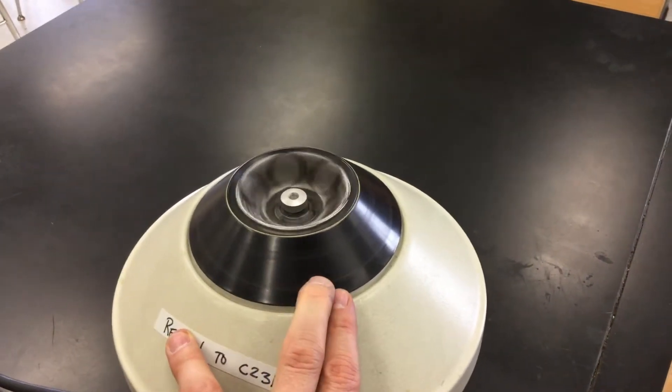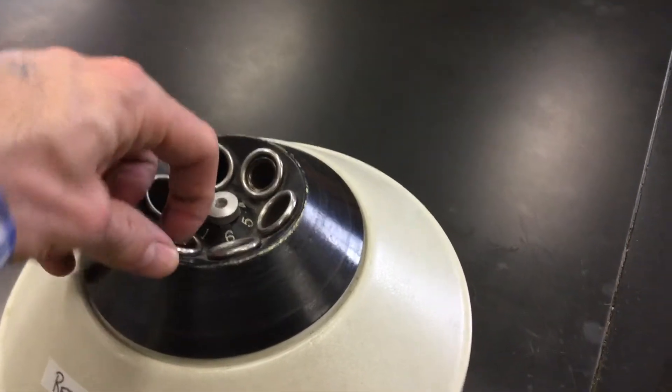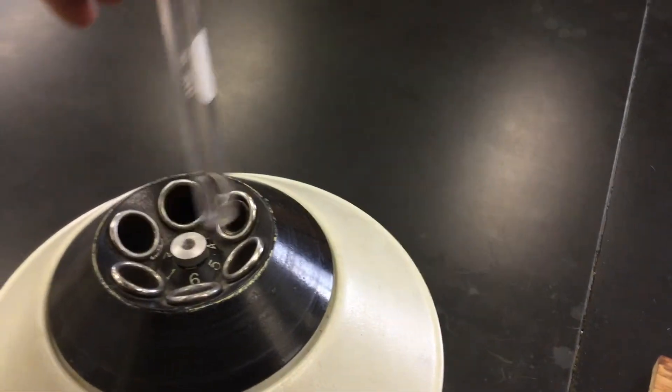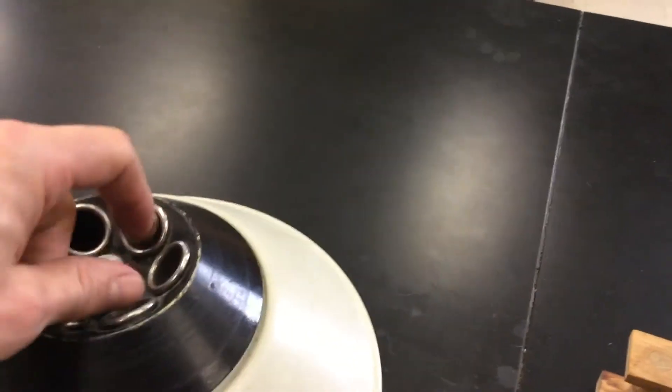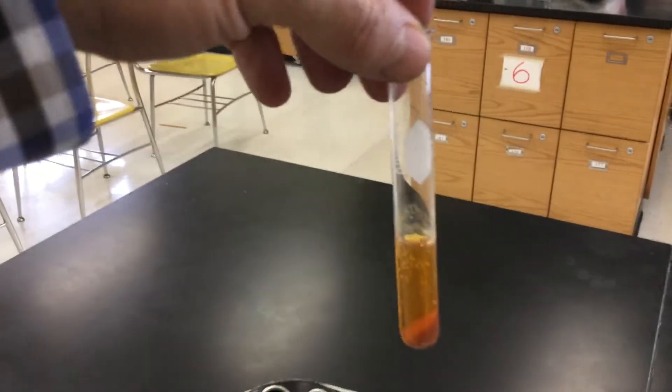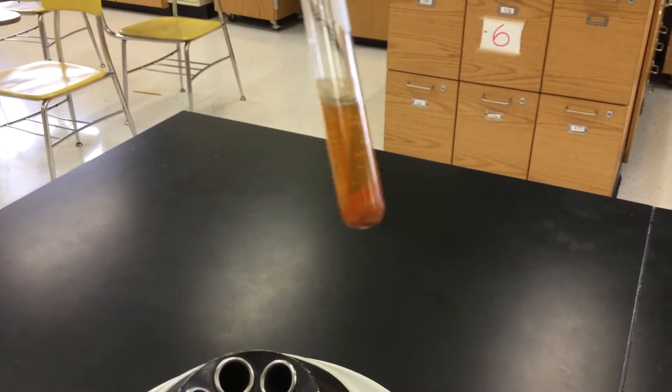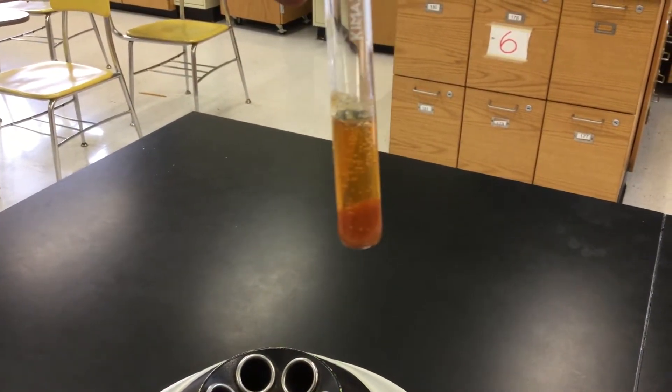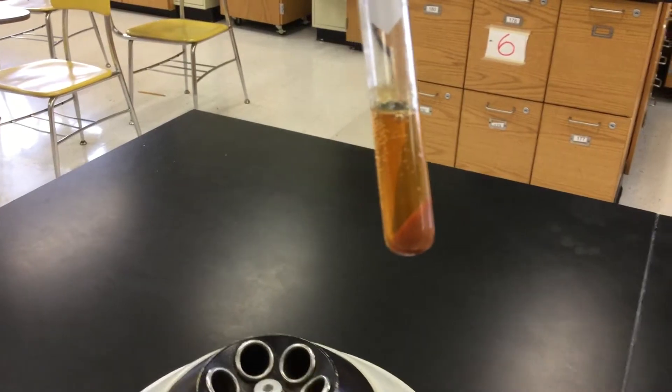Now I'm going to take my chemical out. So here's the empty test tube. I'll put that away there. And then here's the test tube now. And now you can definitely see that reddish brown solid has all clumped to the bottom because it's spun at a high rate.